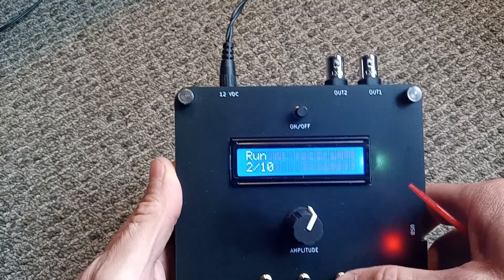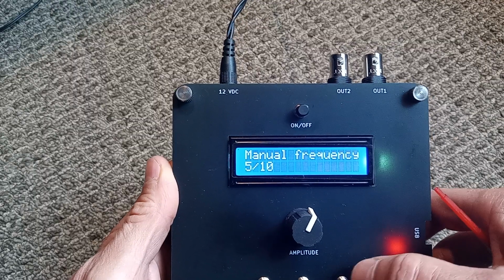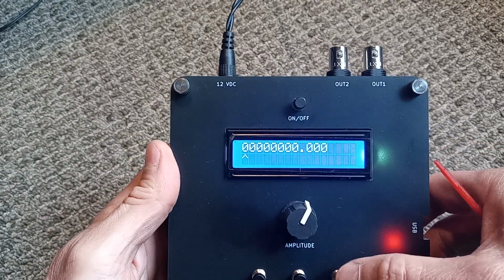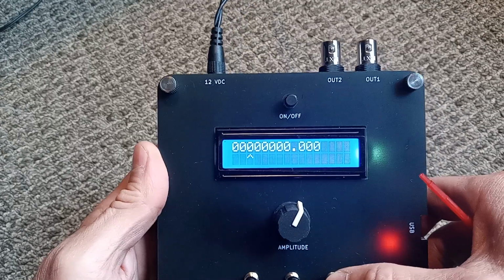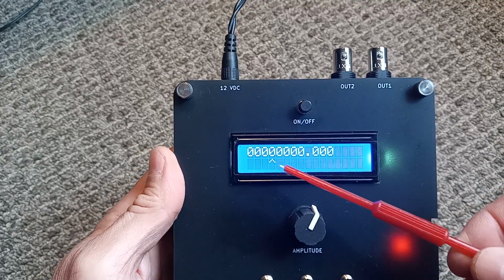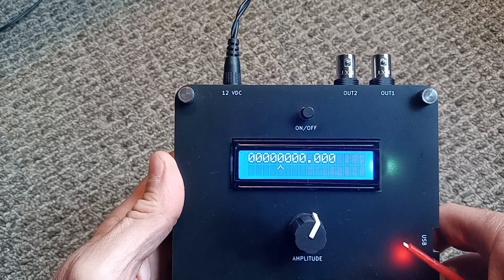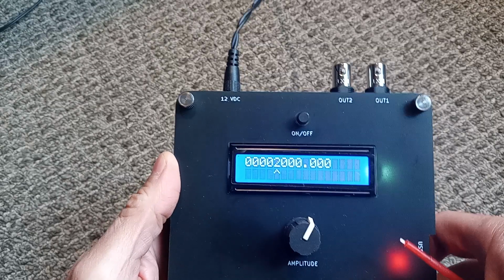Now I'll show you how to enter a single frequency. So I'm in the main menu right now, and I click next until I see manual frequency. Then I click enter. And then it shows you, in this case, all zeros, and you can use the next and previous buttons to scroll. There's a little pointer here that shows you which digit you want to change. So if I wanted to enter 1000, for example, I would place the little pointer where the 1 should be, and I click enter, and then I can use previous and next to change that number.